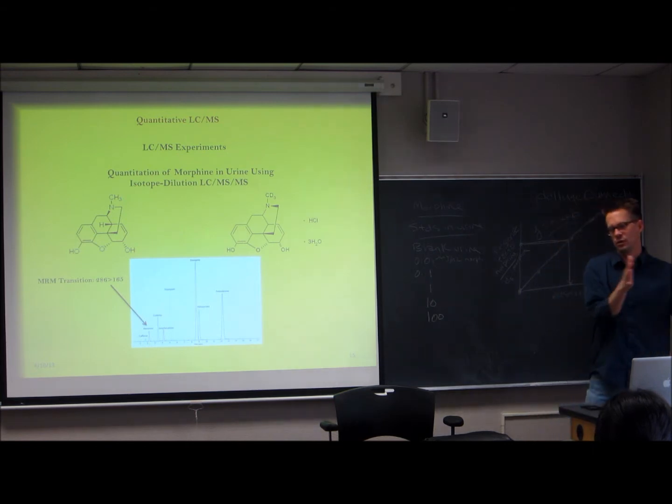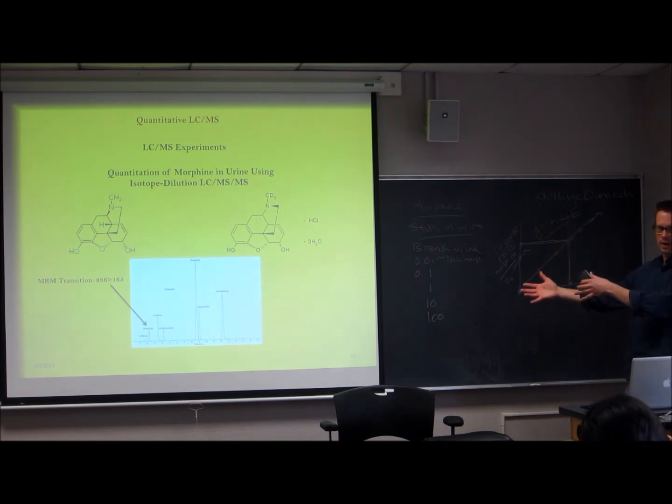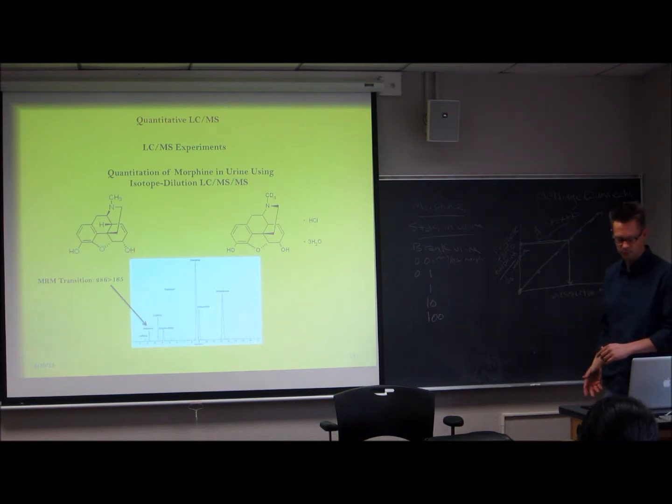So regardless of whether you're doing solids, liquids, what your sample matrix is, by spiking that precisely known amount of internal standard into your sample prior to doing sample handling, extraction, bringing it over to the LCMS, letting it sit there for 3 hours waiting to be analyzed, the mass spec source starts to get dirty, the overall responses come down, but those ratios remain unchanged so that you still get accurate quantitation.